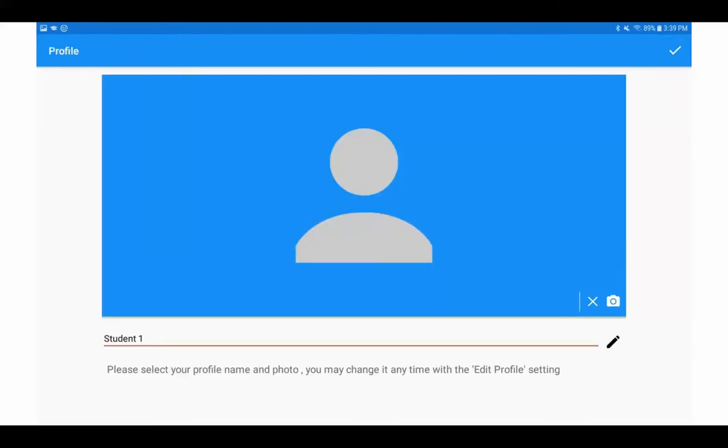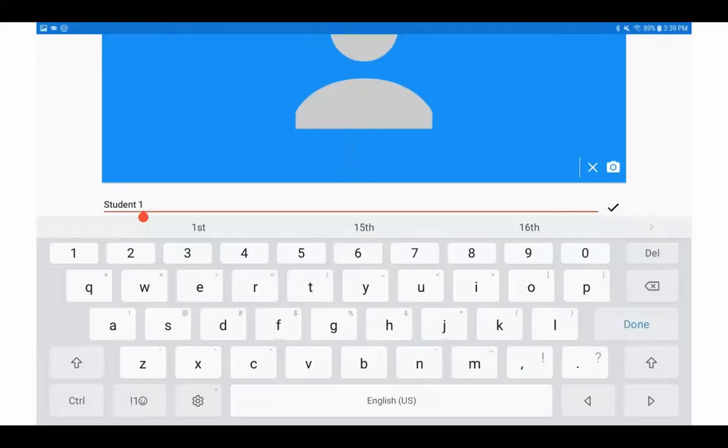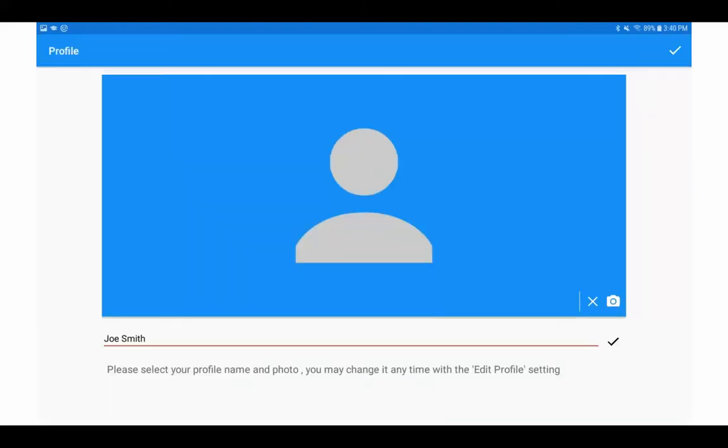They will then be presented with the student name that they can edit by clicking on the pencil. Once they've clicked on the pencil, they'll be presented with an on-screen keyboard, which they can use to edit the name. Once they're done editing the name, they can press the checkbox at the right hand side.